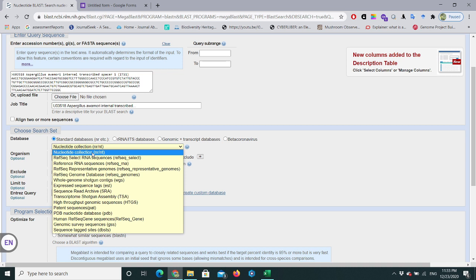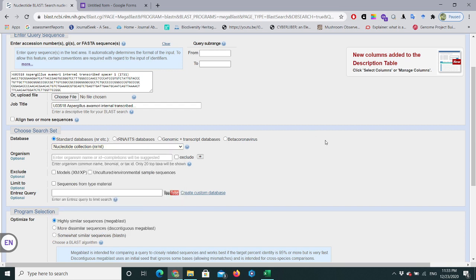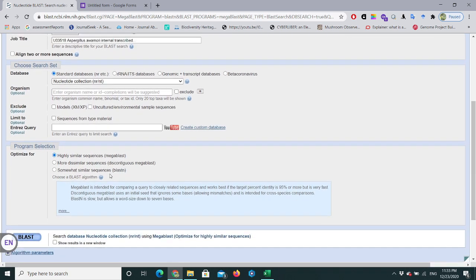If you click on it and go through the help file, you will see the total number of nucleotide sequences in NCBI. When you start BLAST analysis, NCBI will compare your sequence against this collection. Below that, the most important part of this page is 'Program Selection', where you need to optimize this analysis for your purpose. If you want to find similarities between sequences from similar or the same species, you will need to select 'Highly Similar Sequences (MegaBLAST)'.